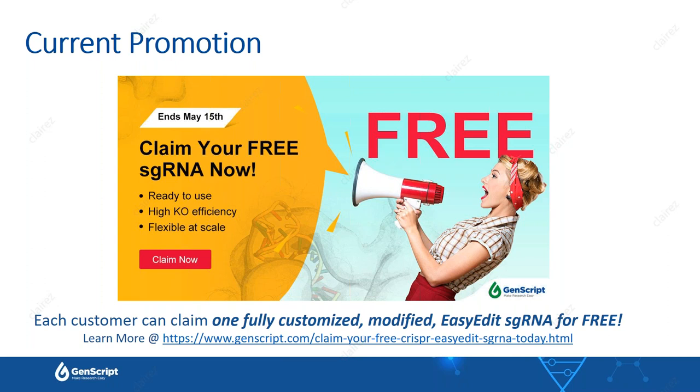How big is the RNP in terms of nanometers? That is a very good question. In terms of the actual size of the protein, I don't think I have that data. The Cas9, in terms of structural data, is pretty well established, so you should be able to find that information online.